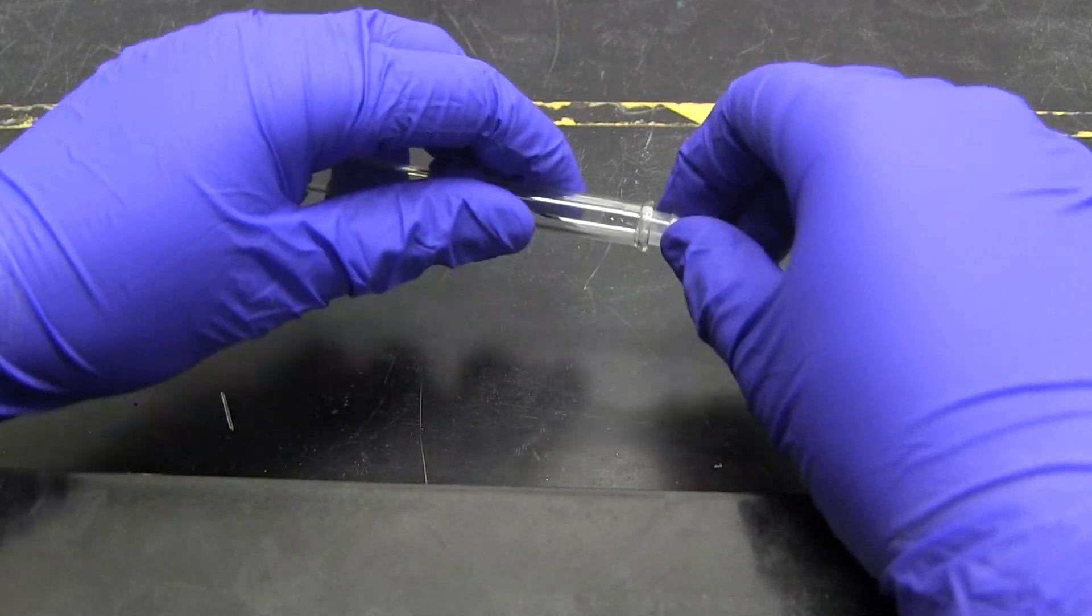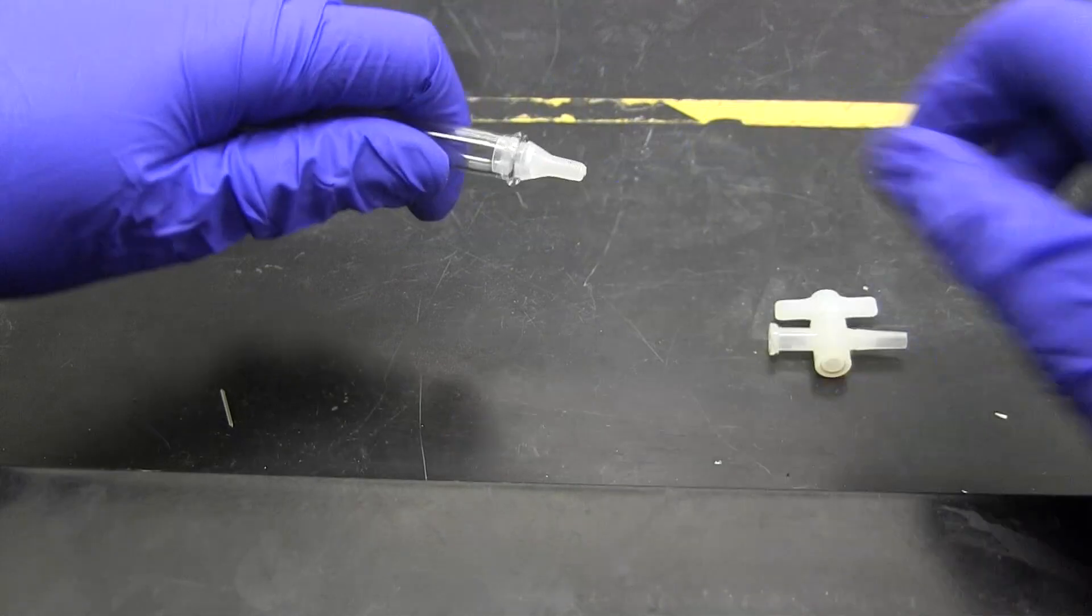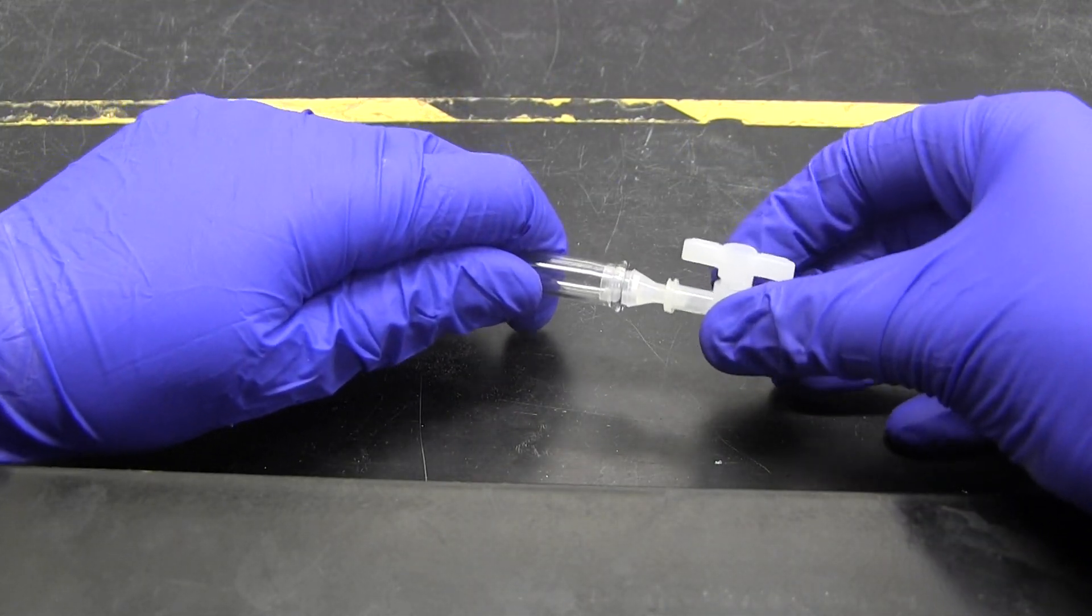Assemble the Microscales Chromatography Kit. Make sure the stopcock is in tightly, and also make sure that there is a frit in the plastic stopcock.